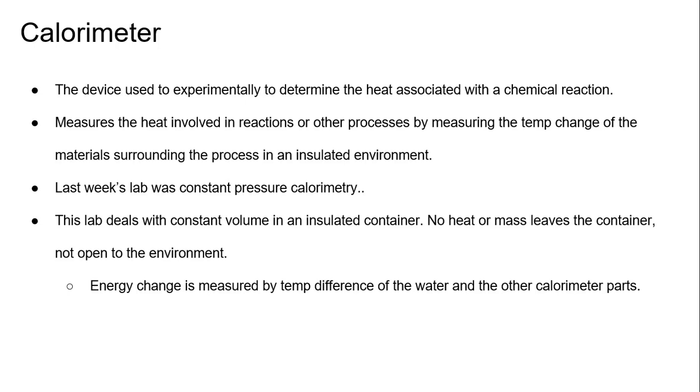Let me begin again: it measures the heat involved in reactions or other processes by measuring the temp change of materials surrounding the process in an insulated environment. And we'll go into that later, what that means.